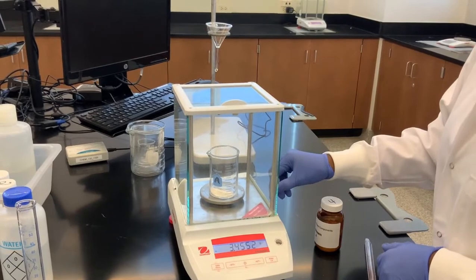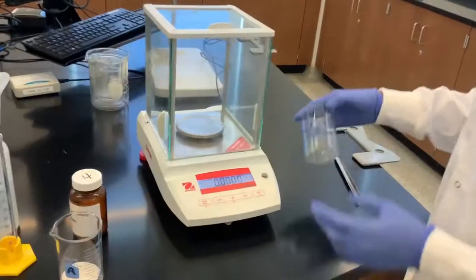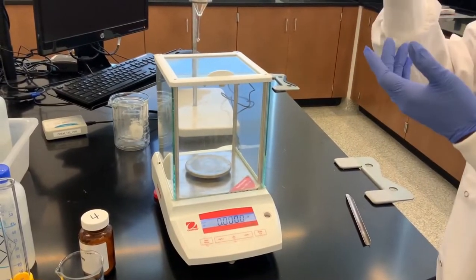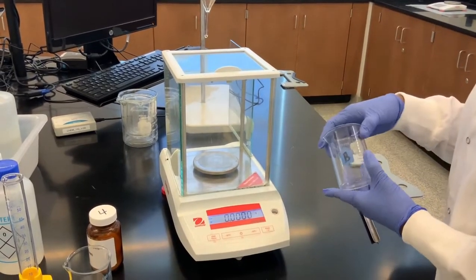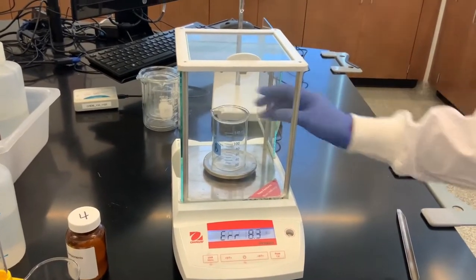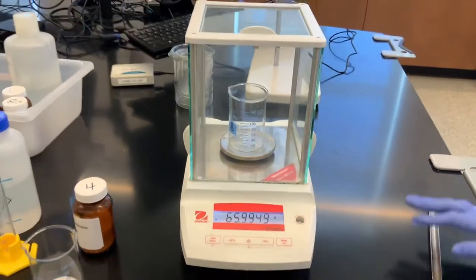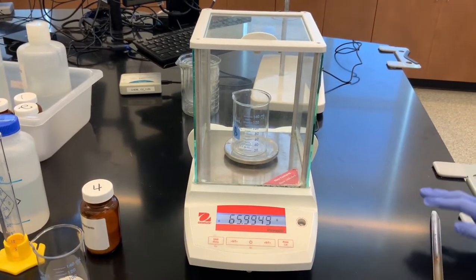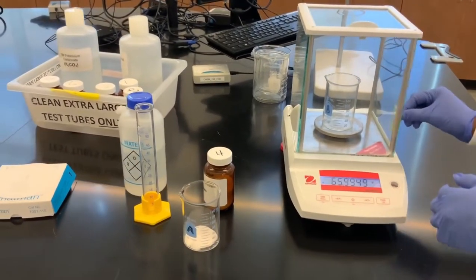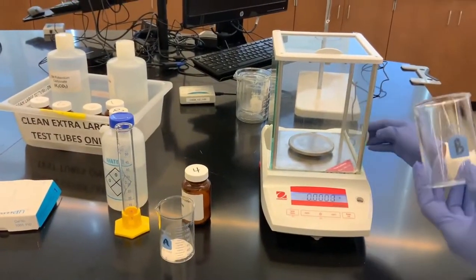Okay, so this is my beaker A. Here is beaker B. We're going to take the measurement of just the empty beaker and record it. You see it's reading 0, it starts with 0. Let's see how much this beaker weighs. It weighs over 65, as you can see from here. Great, so this is the weight of beaker B. We record it in the lab manual and then continue with our experiment. We're going to use beaker B later on.